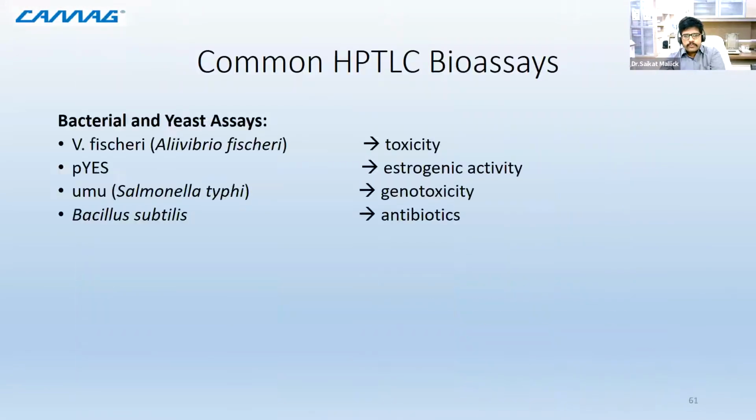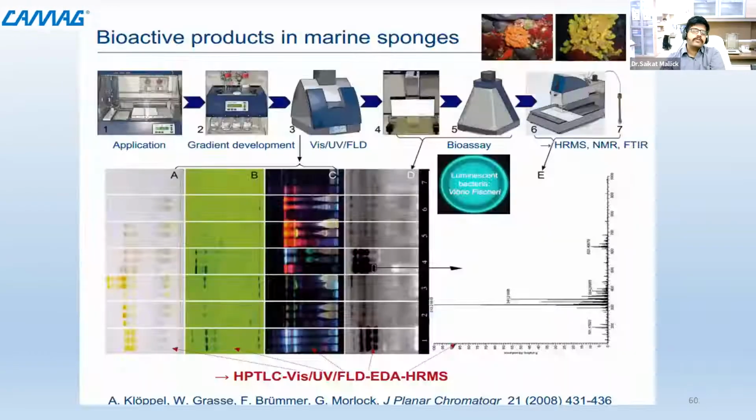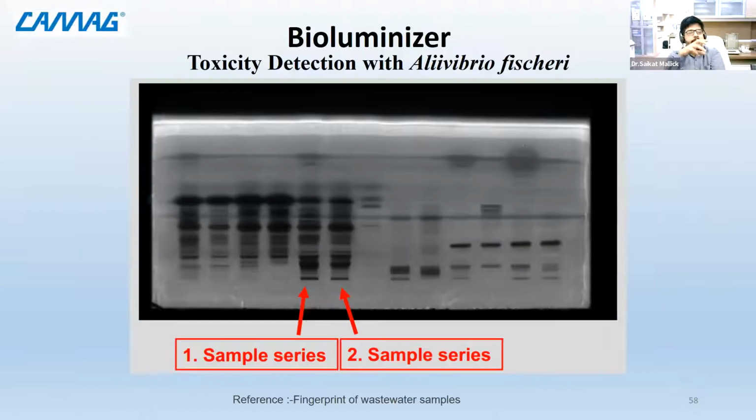I have put a photo. Let me just check. No, it's not there, but let it be. There was an image with me where apple juice was being tested for such toxicity. And in one place, one of the apple juices was so very well pasteurized and preserved that it was actually enhancing the growth. It was acting as a media. So that also can be found out. So it is typically a toxicity detecting technology with the help of bioactivity.